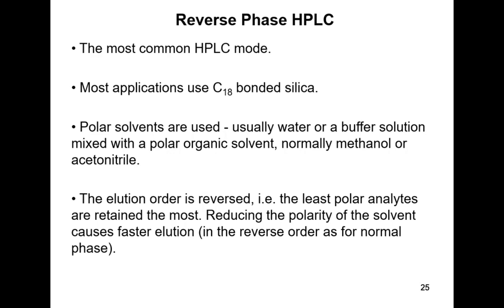It's probably worth mentioning this. It's not been such a problem recently, but there was a period several years ago where the cost of acetonitrile really jumped quite dramatically, and lots of people were desperately trying to redevelop all their methodology to use methanol instead.